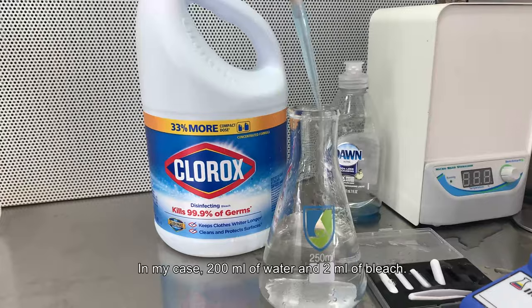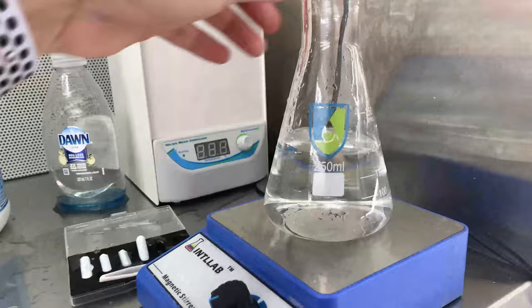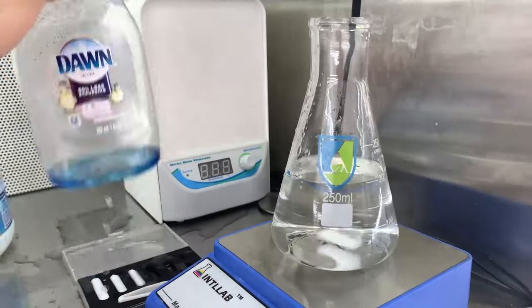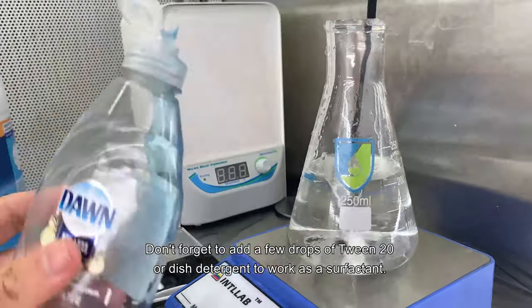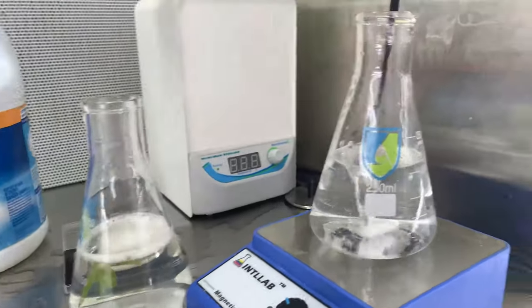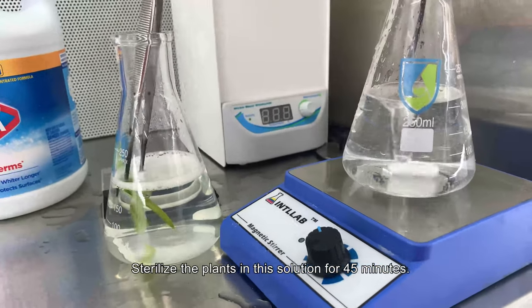In my case, 200 milliliters of water and 2 milliliters of bleach. Don't forget to add a few drops of Tween 20 or dish detergent to work as a surfactant. Sterilize the plants in this solution for 45 minutes.